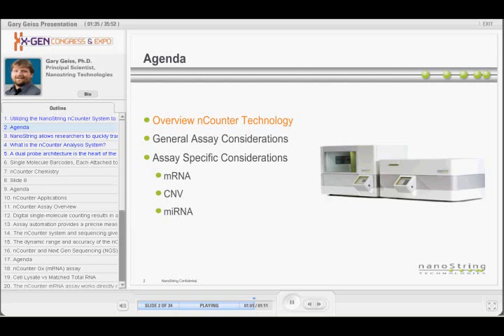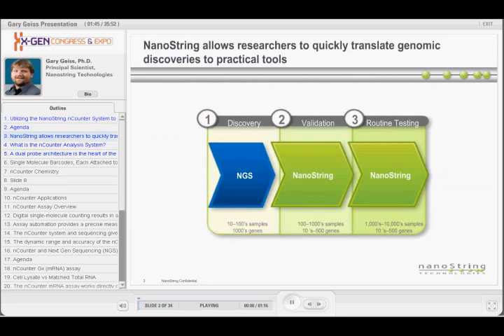And then since this is a copy number session that most of us are attending, I'll talk a little bit about our copy number assay, which I talked about in detail this afternoon.